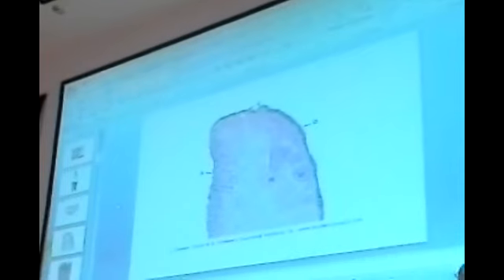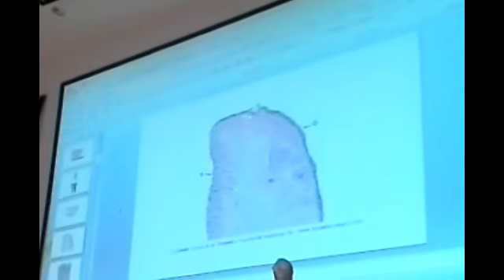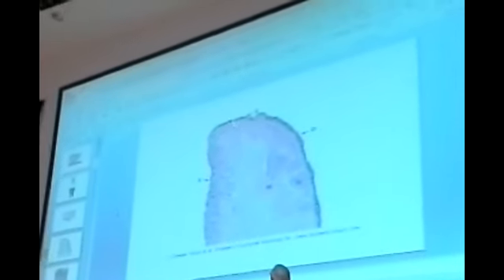What characterizes the red margin? The blood vessels it has, but not clearly in this picture: high dermal papillae. The connective tissue goes up into them. These dermal papillae are vascular and contain receptors for touch. Is this area covered by ordinary skin or modified skin?